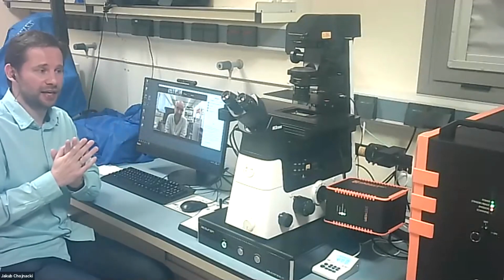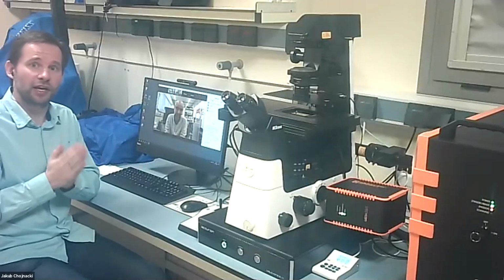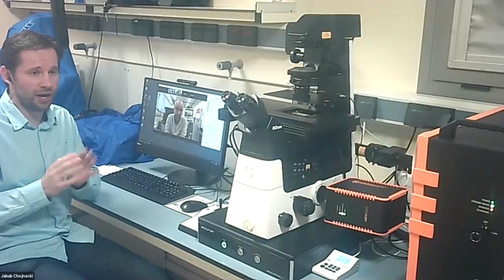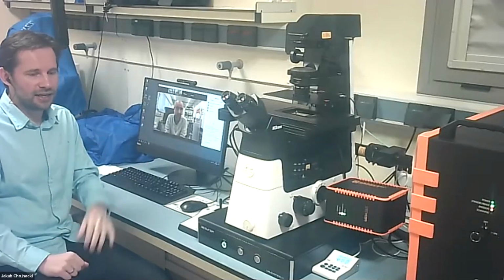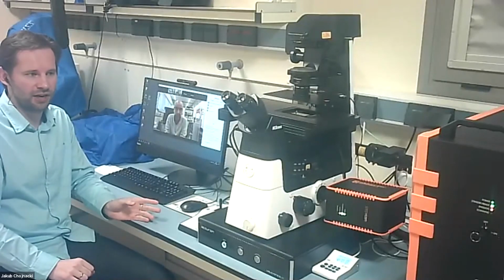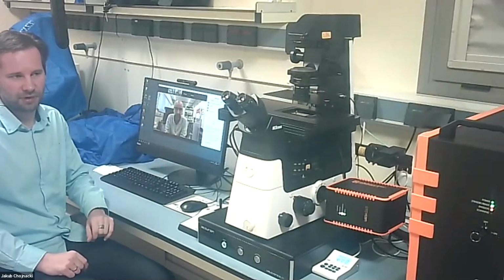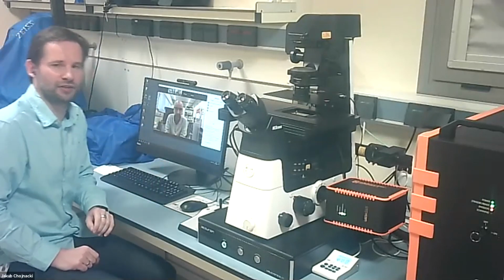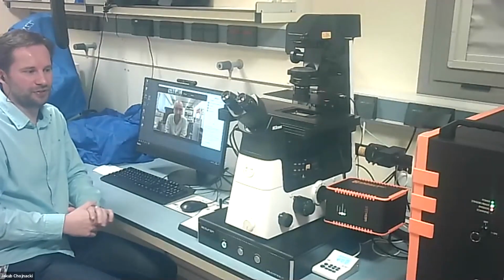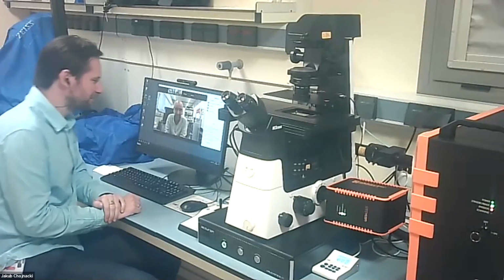But if you want to get a fairly basic microscope, I really recommend you look at those Lego projects, because you can build a competitive microscope for 1,000 or 2,000 euros. Of course, more research microscopes will set you back a few thousand euros. It's related to complexity. But this type of microscope, we're talking about 300,000 euros, unfortunately. So look at those Lego microscopes, and those can actually be built and can be quite useful.